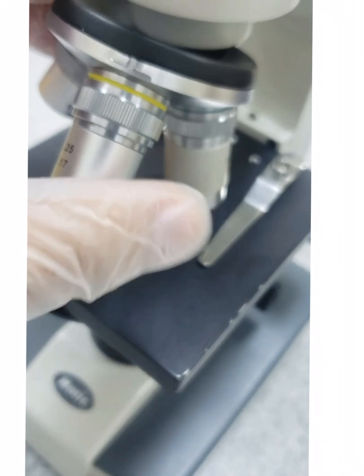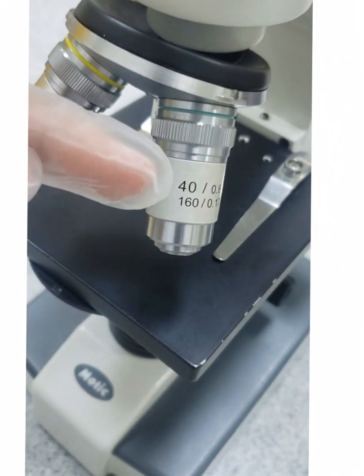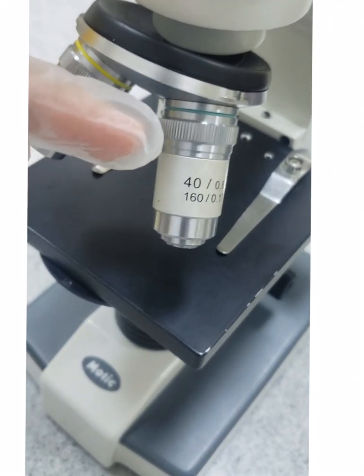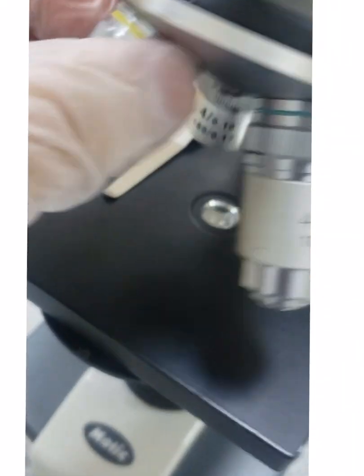The same for this one. This lens is 40 times magnification. So it zooms 40 times. I'm looking at the object 40 times bigger through it. The same for this one.